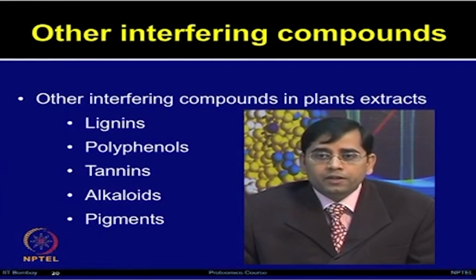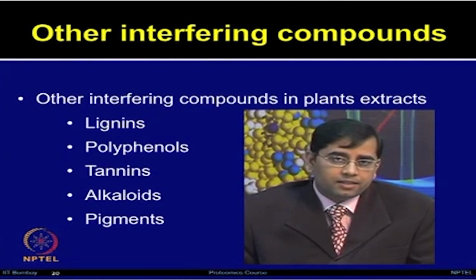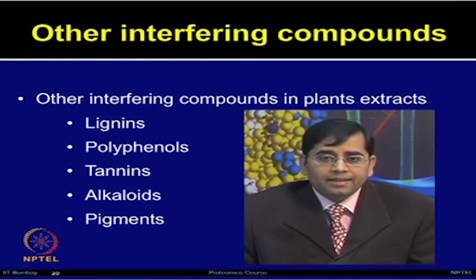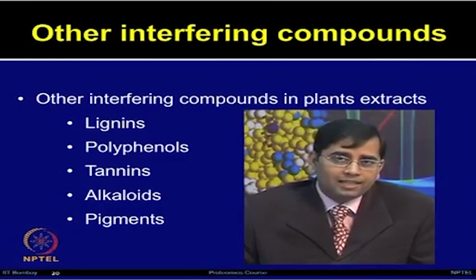There are a few interfering compounds which are also present in the plant extracts, such as lignins, polyphenols, tannins, alkaloids and pigments. I will talk about some of these in more detail in the next class, in the case study on how to perform plant proteome analysis.